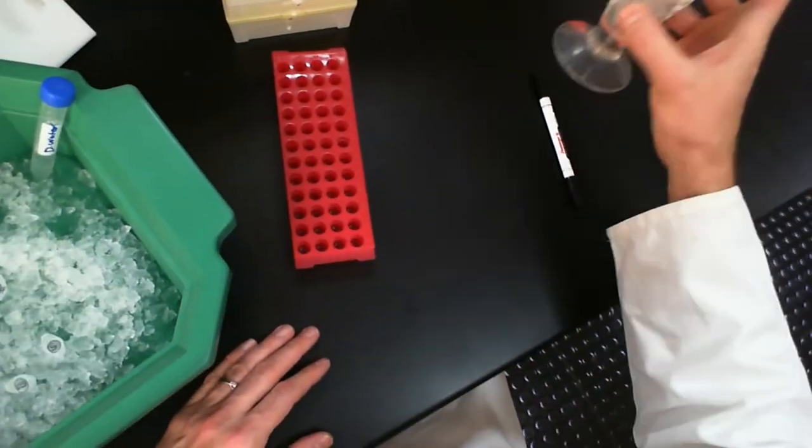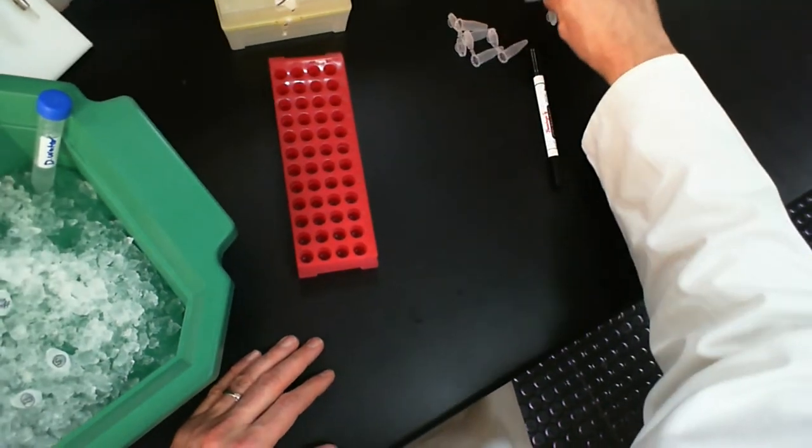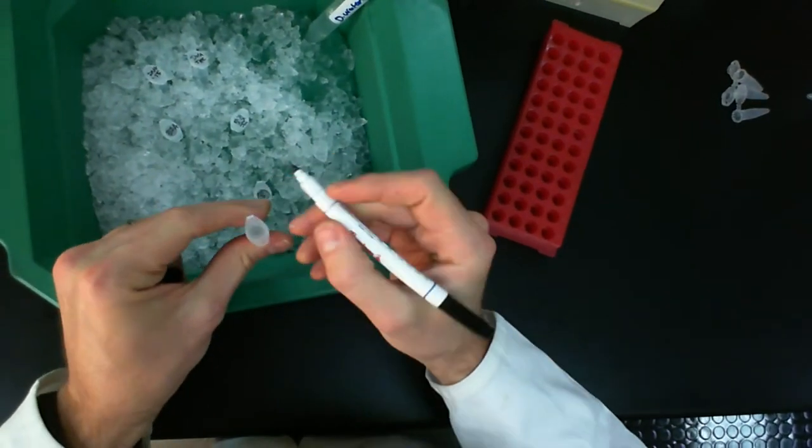So first of all I need some epitubes, so let's get some out. Too many. I'm just going to need 4 of these. I'm going to label them. The first one is going to be P1.